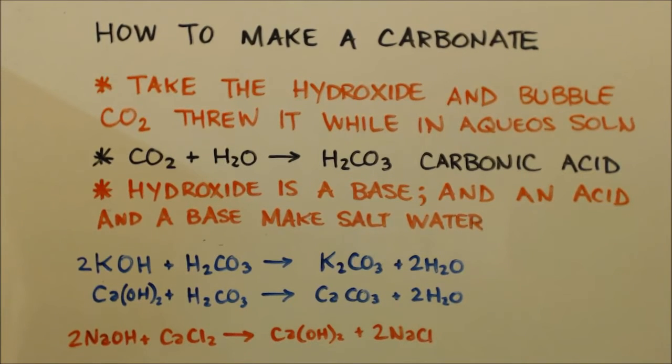Now what I do, because I actually buy potassium hydroxide that's already in water, is when I buy it, I put it in a tray and I want to recrystallize it because it's soluble in water. But I don't like to do it fast. I just put it in a glass pan and throw it on my radiator, my heater in my house.